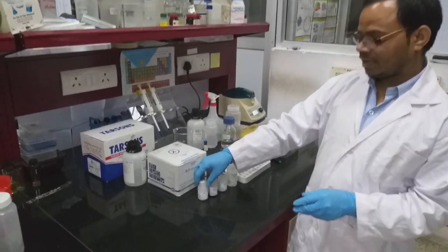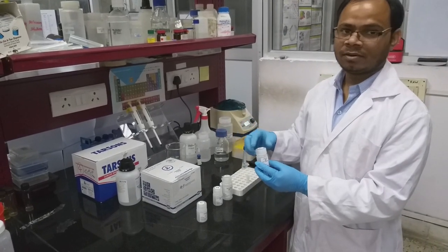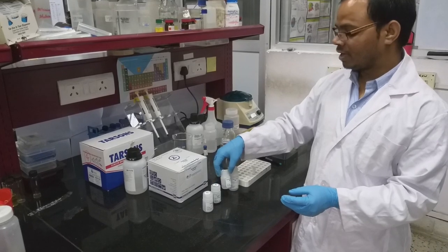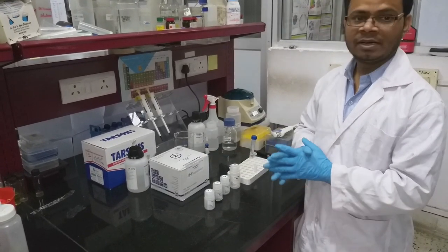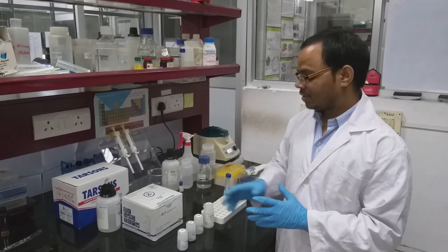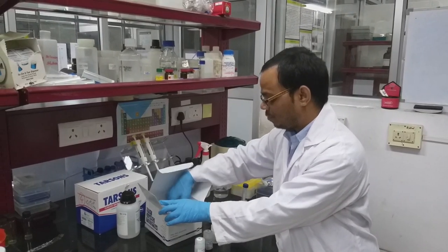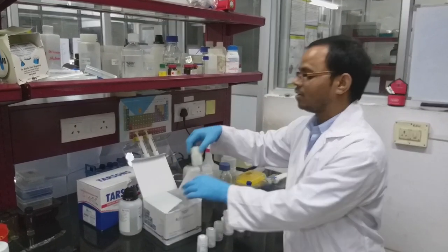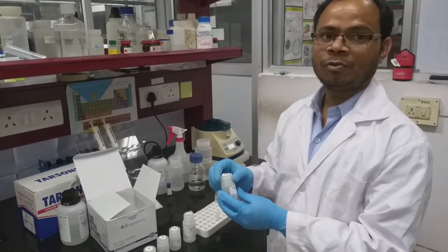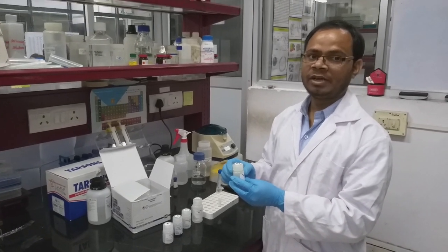The composition of the lysis buffer is the same as the previous method, and also the neutralization buffer, resuspension buffer, every buffer contains the same composition. But in commercial kits, we have one extra wash buffer which will remove any unwanted contamination and give pure DNA.